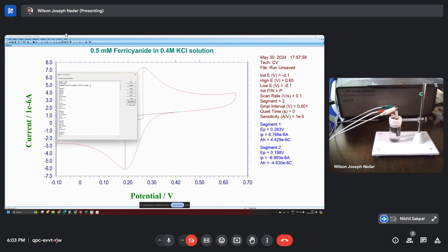And this header is nothing but whatever header you want to see on top of your experimental data screen, that you can define here. So this is of least importance. In case you are willing to have a title over the graph that you can define here.